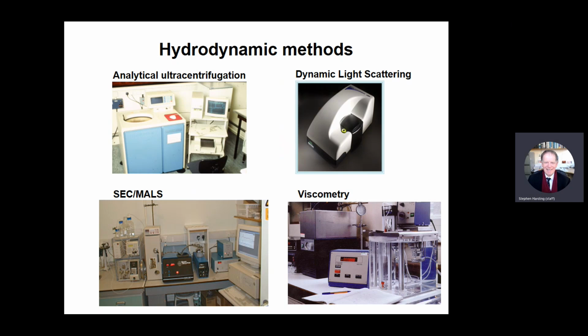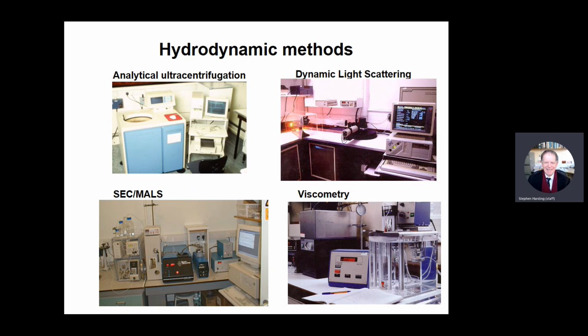Everything's got smaller, lasers become laser diodes and all that sort of stuff, and it's great in a way, because from a health and safety point of view, everything is boxed in. When we did this, it had all sorts of safety controls because of the laser. The experiments were done in the dark because we were frightened of stray light interfering with the measurements. If someone put a switch on or something in the next lab, that would send a pulse through and would disturb the measurements. So that was a different time, a different sort of ethos towards doing experiments.